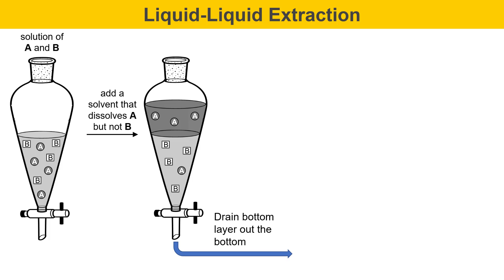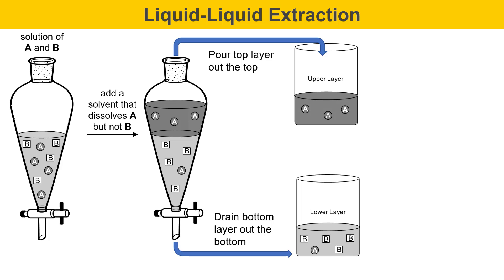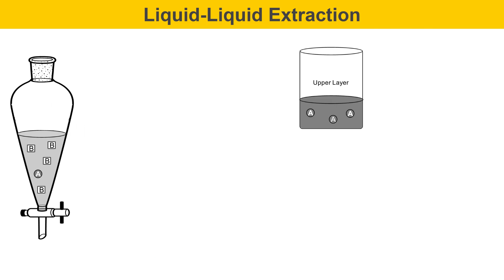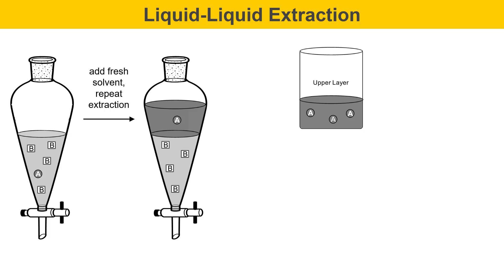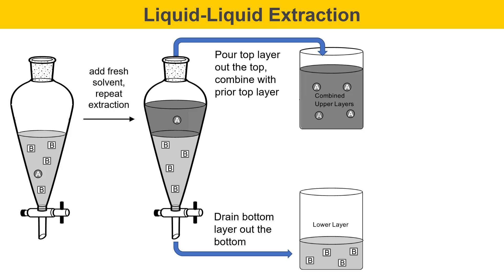Drain the bottom layer out the bottom and collect it in a beaker, then pour the top layer out the top of the separatory funnel to collect it separately. Now put that lower layer back into the separatory funnel to go after the remaining A molecules. I'll add a fresh portion of solvent and repeat the extraction. The hope is that the rest of the A molecules will migrate into the upper layer. Then drain the bottom layer out the bottom — now containing the B molecules — and pour the top layer out the top, combining it with the previous A layer to give a combined upper layer containing hopefully all of the A molecules.